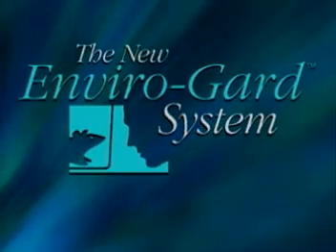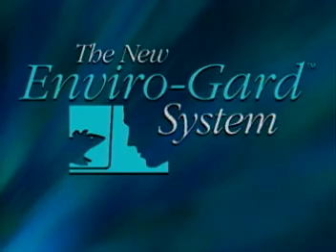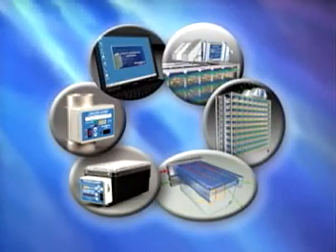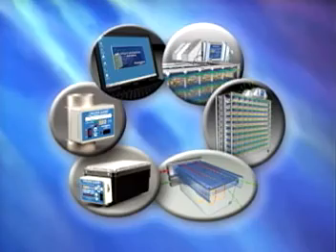The EnviroGuard environmental control systems take the guesswork out of high-density housing systems equipment operation and performance. The EnviroGuard line of products offer a solution for every level of ventilated housing requirement.